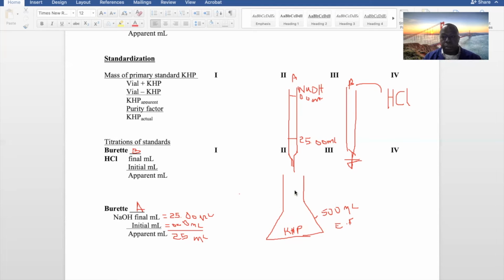It is acidic, if you are using, of course, phenolphthalein. So if you are to back titrate this, and I'm just picking some numbers here, 0.000, and then maybe you use a small amount, let's say 1 ml or 0.5 ml, whichever volume you use.